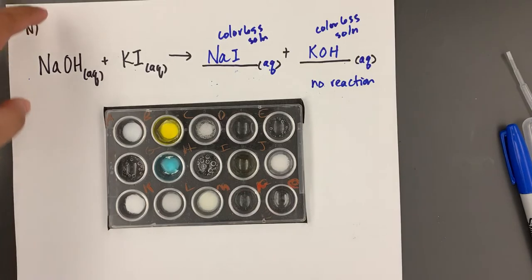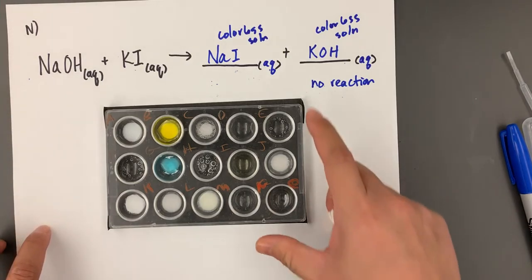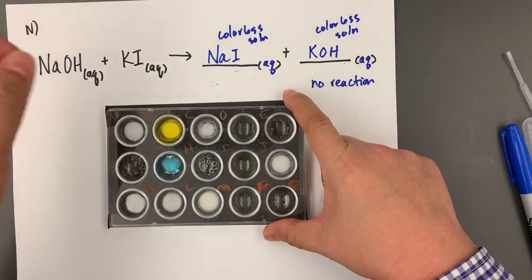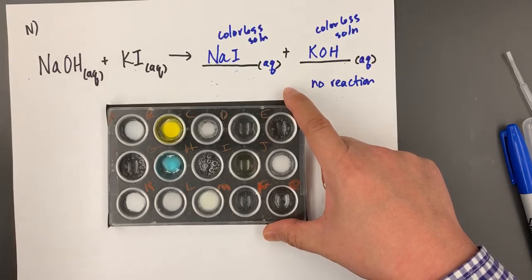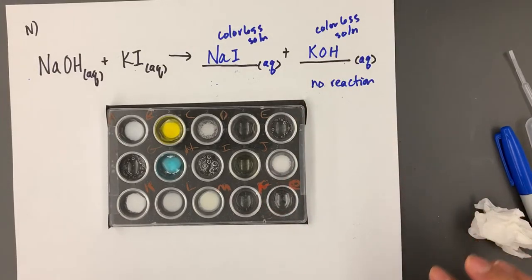Then in your observations, write down your 4 compounds, those 2 starting materials and the 2 products. Then rewatch this video, and as you see me do a reaction, you're going to write down what I'm using, colorless solutions or blue solutions, and then write down what you observe, yellow precipitate, colorless solution, and so forth. I hope that that video was clear.